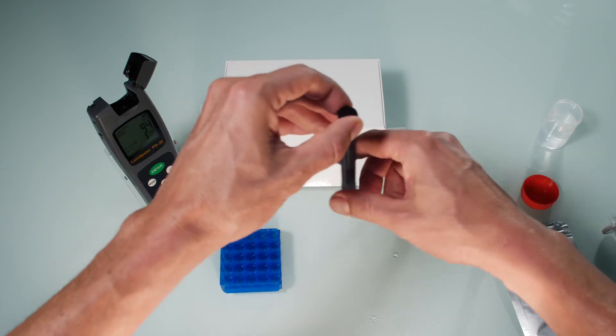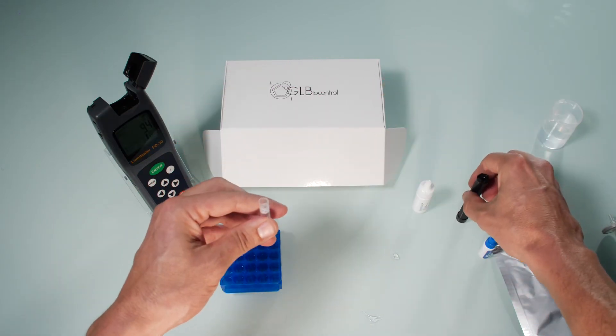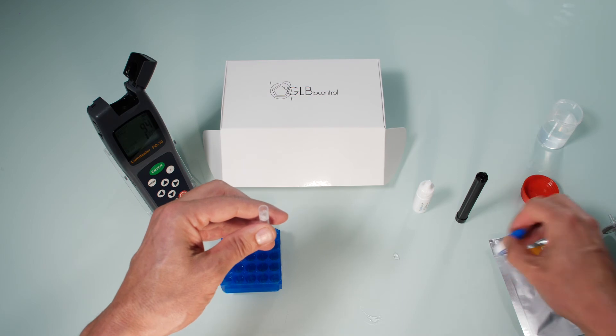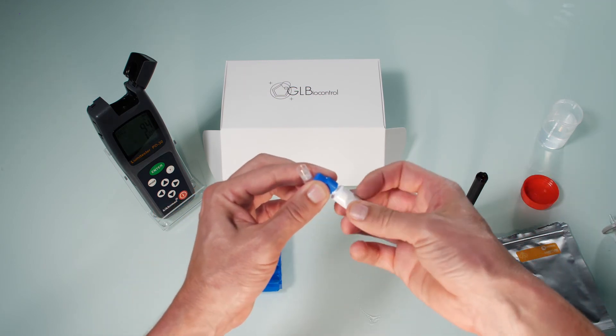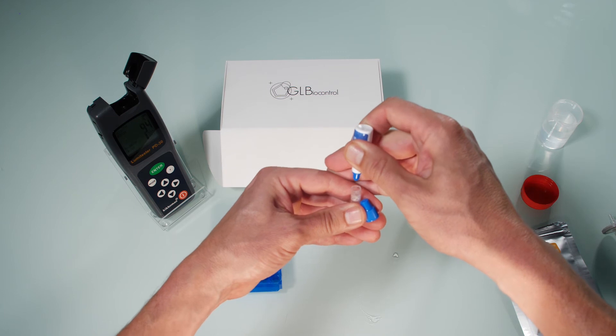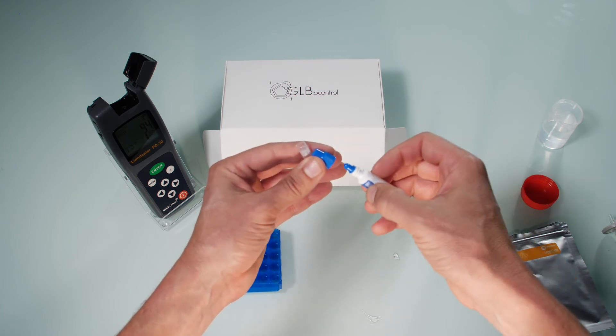Open the lid and take out the lumi tube. Add just one drop of standard into the tube. Don't insert the tip of the dropper bottle into the lumi tube to ensure a correct calibration.